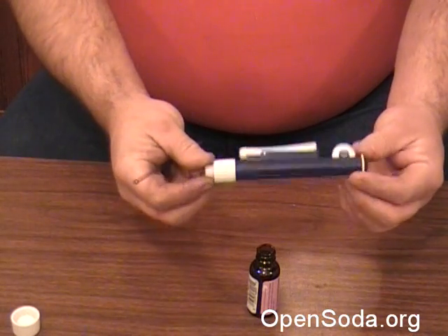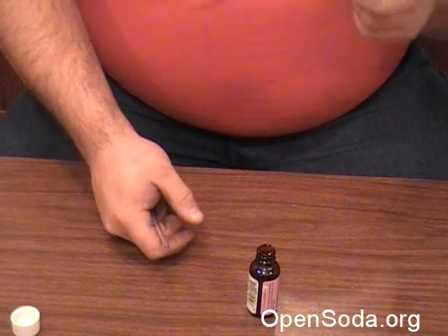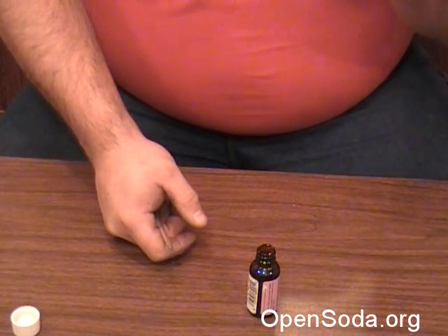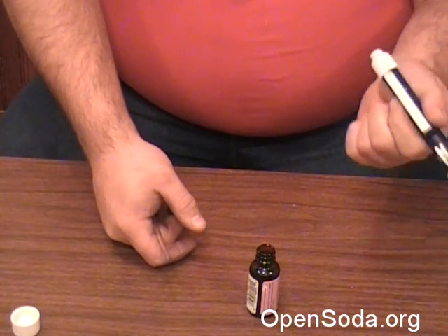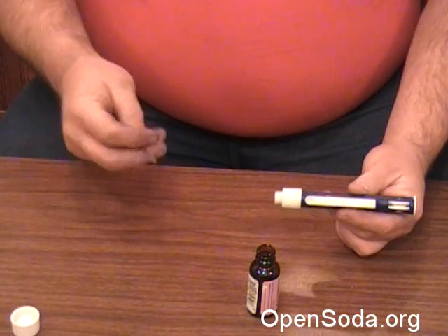This one was $9. I got it from a guy in Toledo — I'll post the link on opensoda.org. You can also just type in 'pipette pump' in Froogle. I've been searching for a pipette bulb for years, which is why I never found these. A pipette pump is what this is actually called.